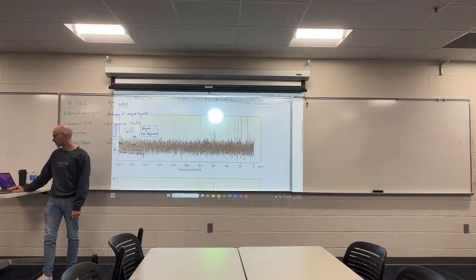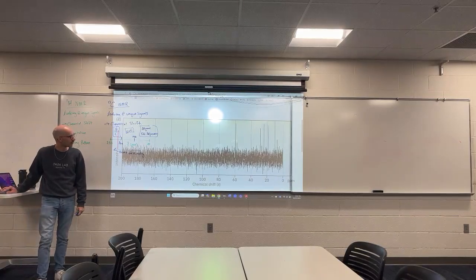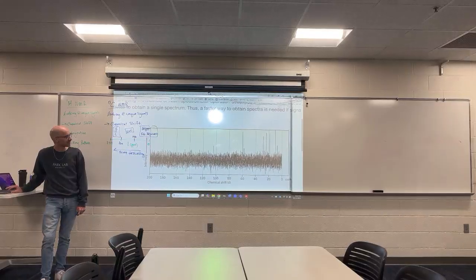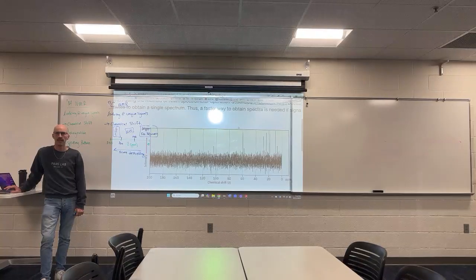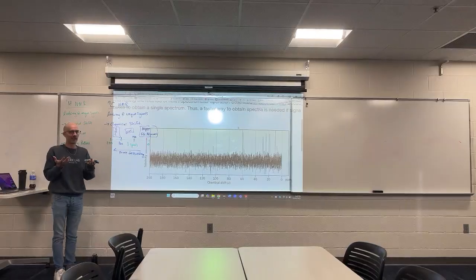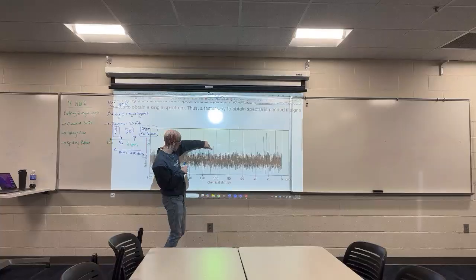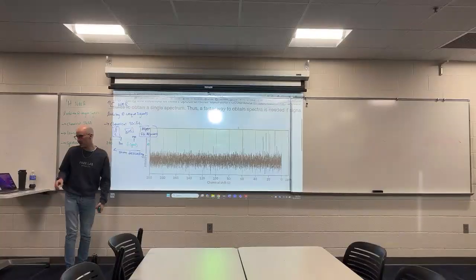And then this is an interesting necessity in carbon NMR. This is a carbon NMR. Can you see the same amount of intelligible information? Like, what there do you think is important, and what should you rule out? This that you're seeing is what we call noise. The instrument is picking up signals, but it's not meaningful signals. This might be something. This looks like something for sure, but it's hard to say what is meaningful and what is not.